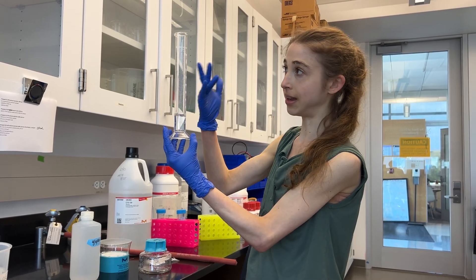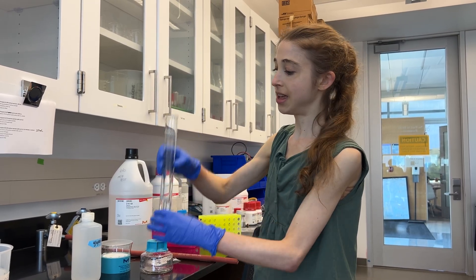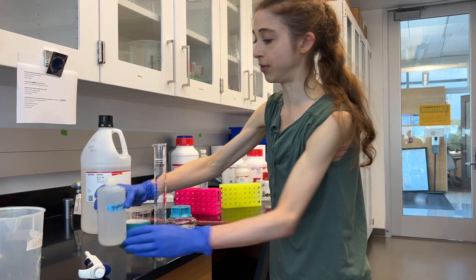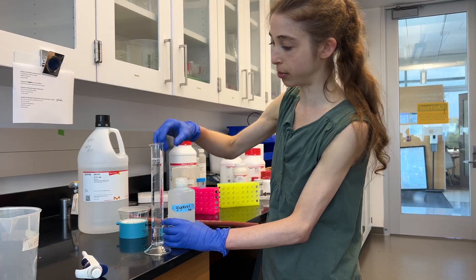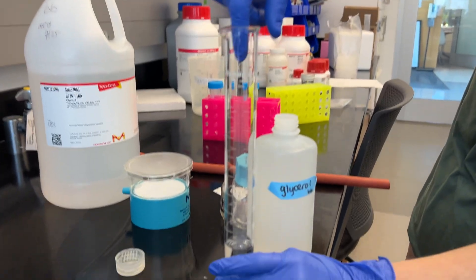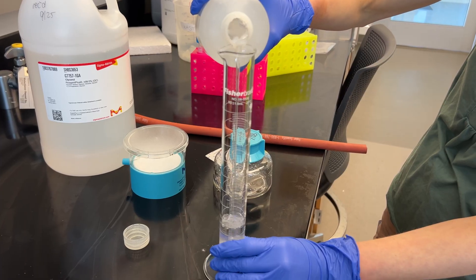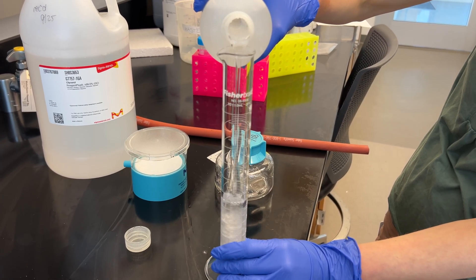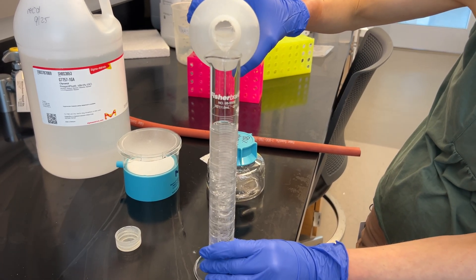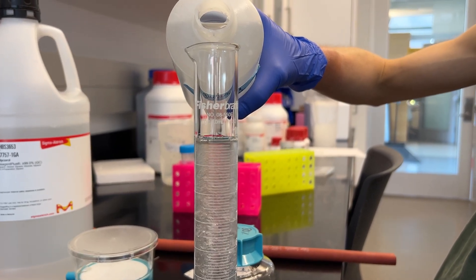I want to make 80% glycerol, so I have 20 ml of water and I'm going to fill it to 100 with the glycerol. Glycerol often comes in these giant bottles, so I transferred it to something easier to pour. I want to pour it carefully into the center of the liquid without getting it on the walls, especially not up high, then slow down near the 100 ml line so the meniscus is right on that mark.